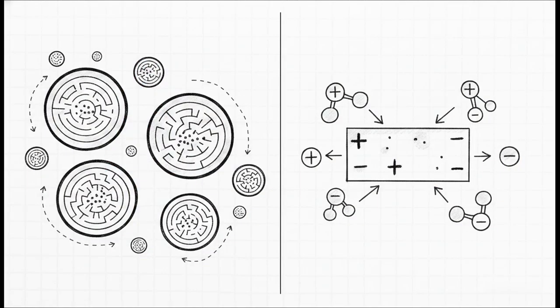And we aren't just limited to polarity. Take size exclusion chromatography, for example. This uses porous particles. The small molecules wander into these tiny pores and basically get lost in a maze, while the large molecules simply bypass them and wash straight down the column. It completely flips our intuition, right? It lets the biggest, bulkiest molecules finish first.